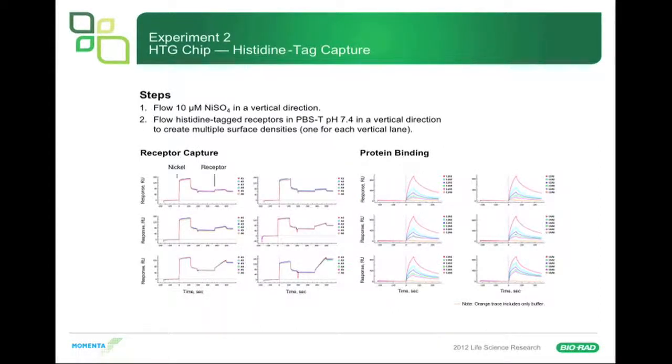Next experiment, we used the HTG chip. We flowed 10 micromolar nickel sulfate in the vertical direction, then flowed the His-tagged receptors in PBST, creating multiple surface densities — one for each vertical lane. We had nickel put on the chip and then different levels of the receptor, with buffer in one lane and increasing amounts of receptor in others — you can see the slope of capture increases as receptor amount increases. But when we put our antibody in solution to look at the interaction, we started seeing binding where we had no ligand. This was all nonspecific binding — horrible nonspecific binding.